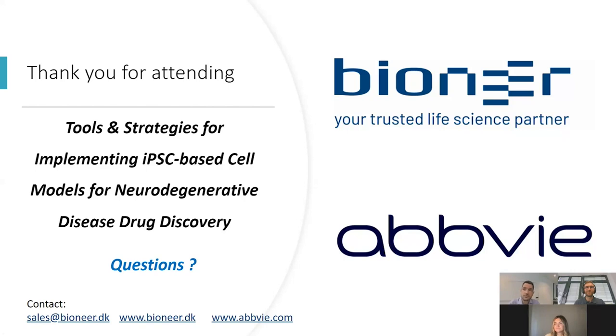Yes, I've done that as well. So we were using plasmids. However, plasmids always have the risk of random integration and wrong integration. So the strategy was to insert a selection marker in the subsequent intron. So if you want to change, for example, a base in a certain exon, you make sure that the selection marker is located in the downstream intron. And then you hope, of course, that the selection marker does not interact with the splicing mechanism. So that's, for example, one risk, that the splicing mechanism doesn't work anymore when you have inserted something into the subsequent intron. We are not using it. The efficiency is high enough to do gene editing without selection markers.